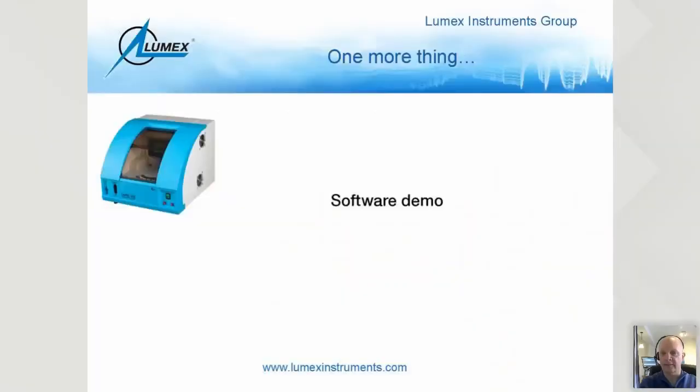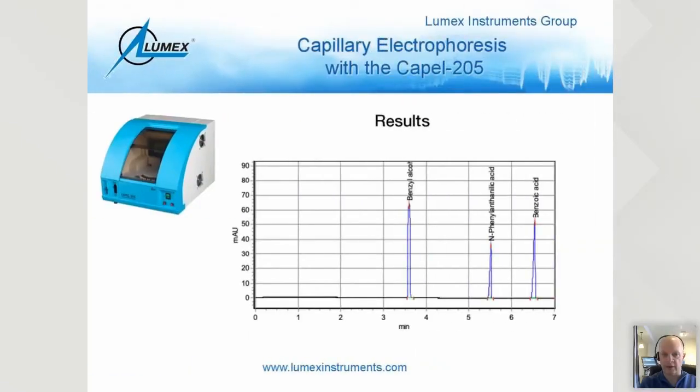Now, if the question was geared towards how many times I need to rinse in between runs, there are several discussions on that by many people, and typically it's a trial and error thing when you're testing this out. What I would say is that you need to check and see when your migration time starts to slip away. If I go back in my slides here, that will be a better way to show you what I mean. If I go back to the results here.